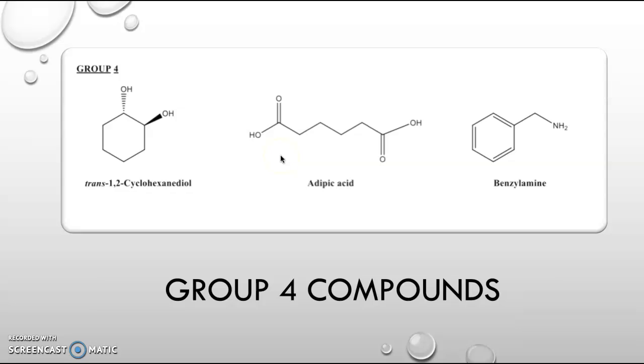So a quick synopsis of how the IR spectroscopy experimental steps would go is that you would first get 2 sodium chloride plates, and then you would add the sample in the middle of the plate with a glass Pasteur pipette, and then after you add it, you would add the other plate on top and sandwich them together. Make sure nothing's leaking out the sides so it doesn't get into the IR spectrometer.